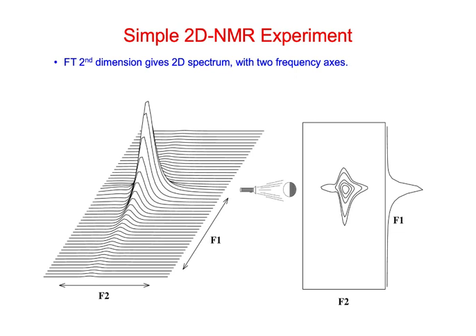All right, and so this is something that we might look like. So again, we have two frequency axes now, because when we do the Fourier transform, we go from this time domain that we're actually acquiring points to the frequency domain. So we have these precessional frequencies that we're measuring.